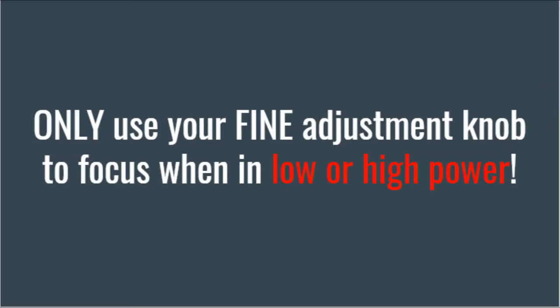Adjust your focus knob again using the fine focus. Once you are in focus, you can again switch your objective lens, this time to high power, which is the blue band.